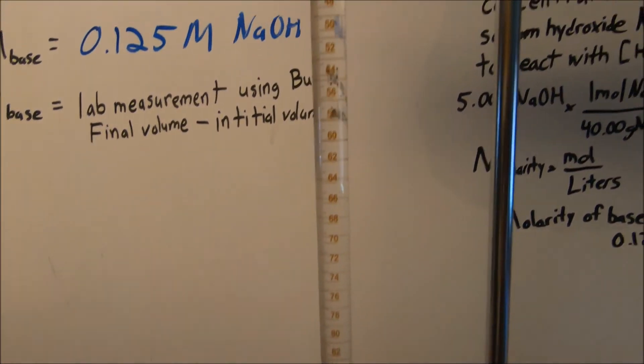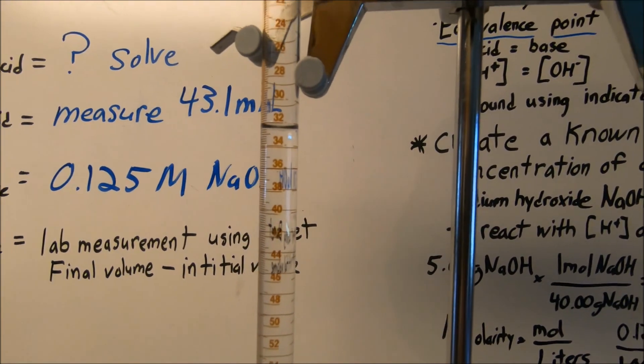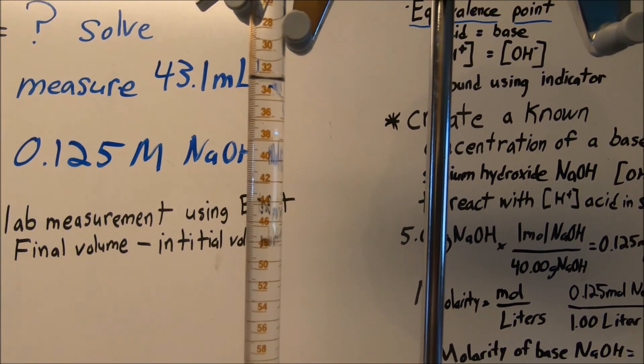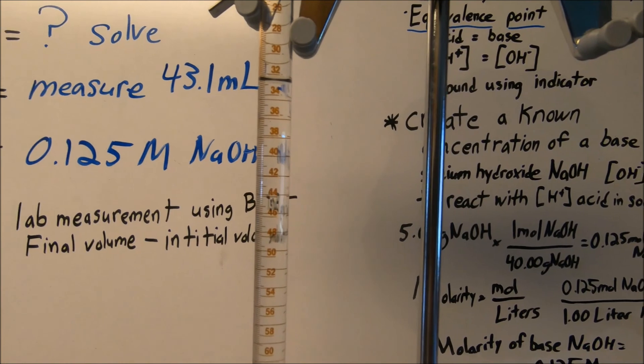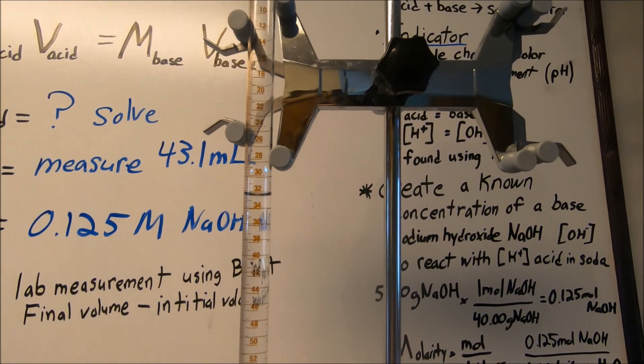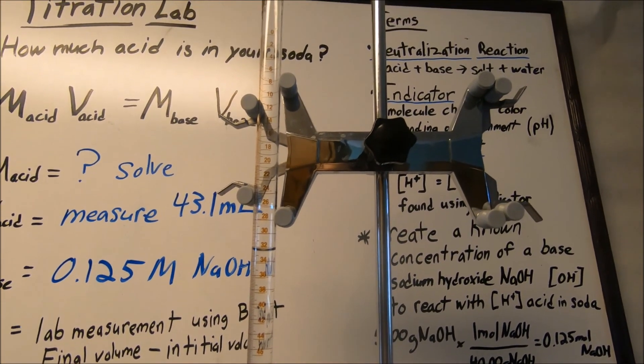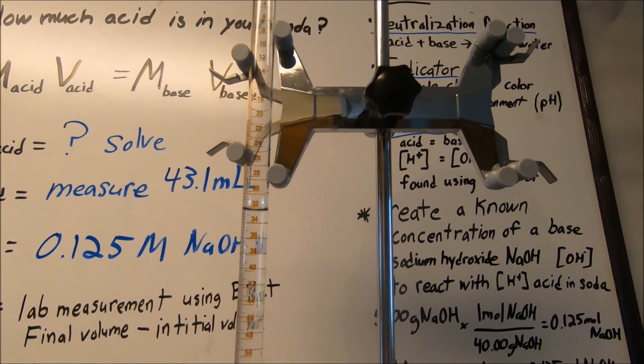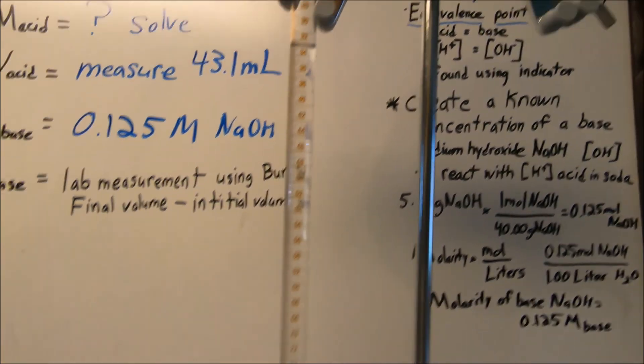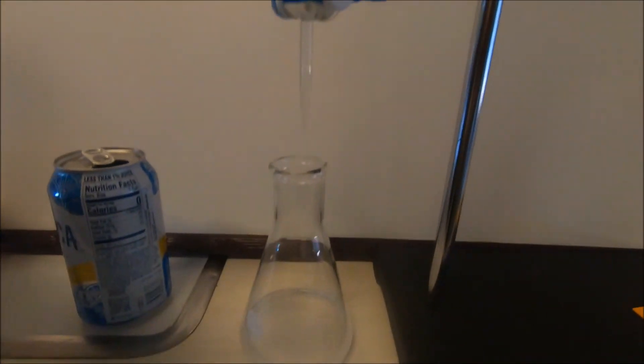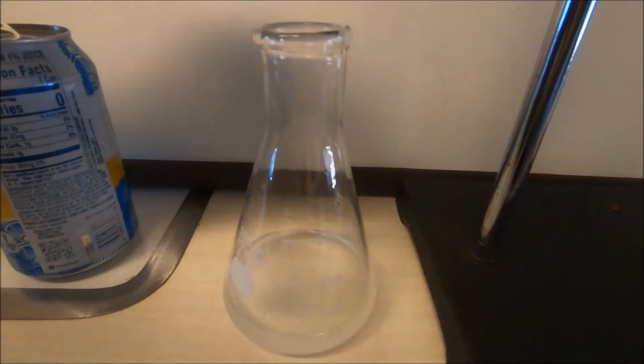We are going to be using our burette to measure. Our burette is set up so that we can actually calculate how much base we are adding to the chemical reaction in order to see that initial and final amounts. Before we get started, our color indicator, our phenolphthalein is going to be put in, we're going to use about seven, eight drops.